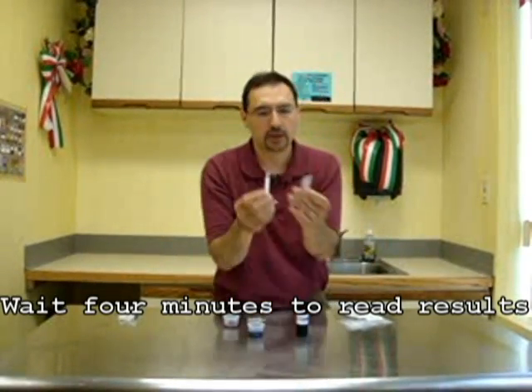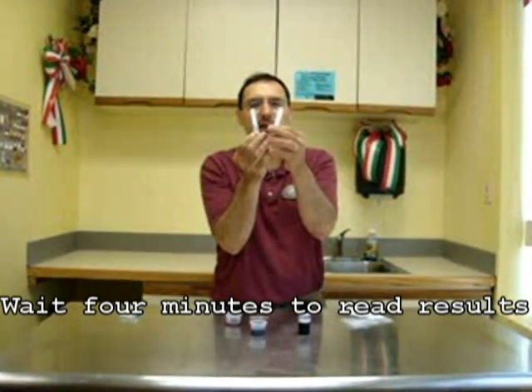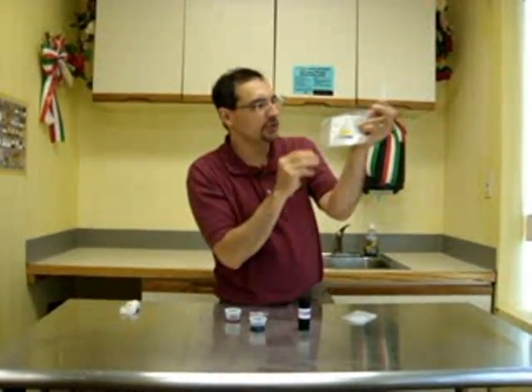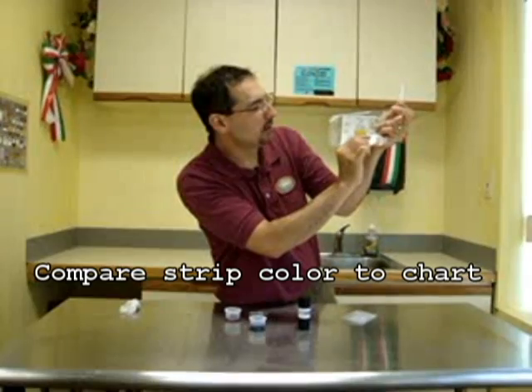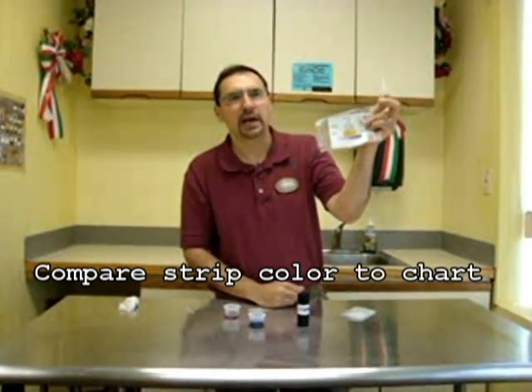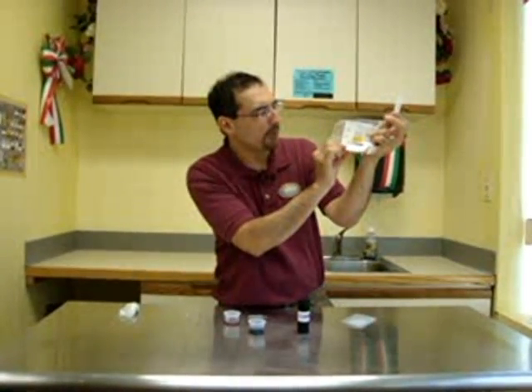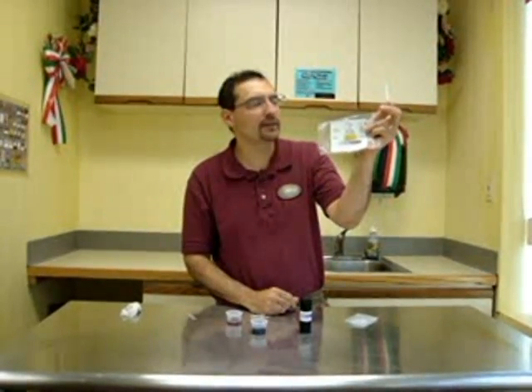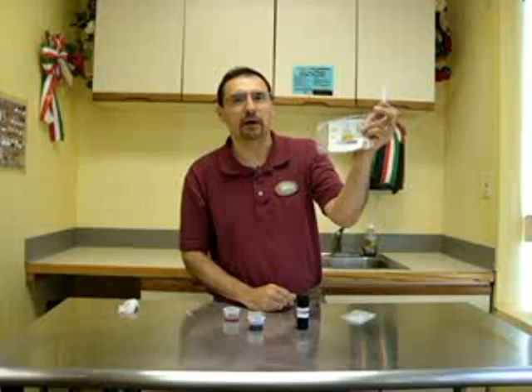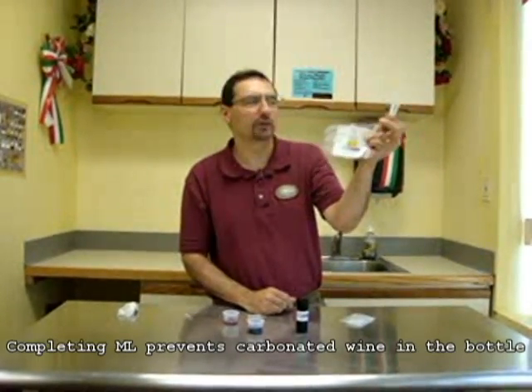It's four minutes before we can actually take a reading. You'll want to read the side that has a small dot on it, and that side will then compare to the chart that comes with the test kit. A color in the dark purple range is going to indicate we have a lot of malic acid present, so the wine has undergone very little or no malic lactic fermentation. When we get to the point where we're getting a reading that's very light gray or almost white, then you can pretty much guarantee that all the malic acid has been fermented out, so the wine has gone through malic lactic fermentation and that malic acid has been converted to lactic.